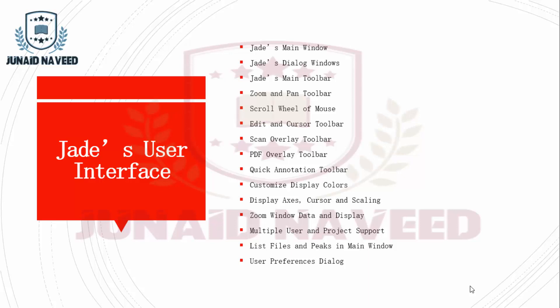In the user interface module, we will be learning the main window, dialog window, and important toolbars such as the main toolbar, pan toolbar, scroll wheel of the mouse, edit and cursor toolbar, scan overlay toolbar, PDF overlay toolbar, and quick annotation toolbar. We will also learn how to customize display settings, colors, and display axis and scaling.